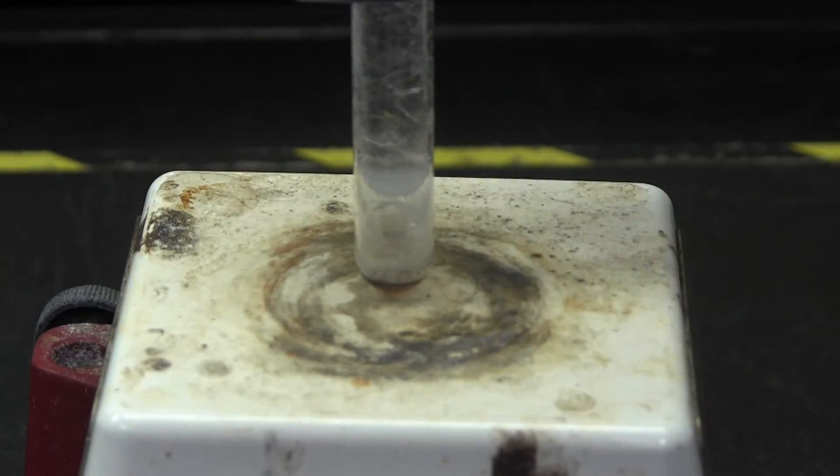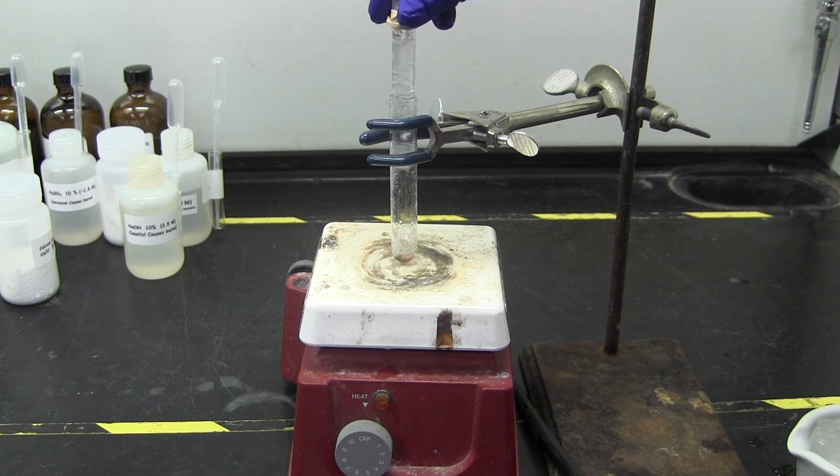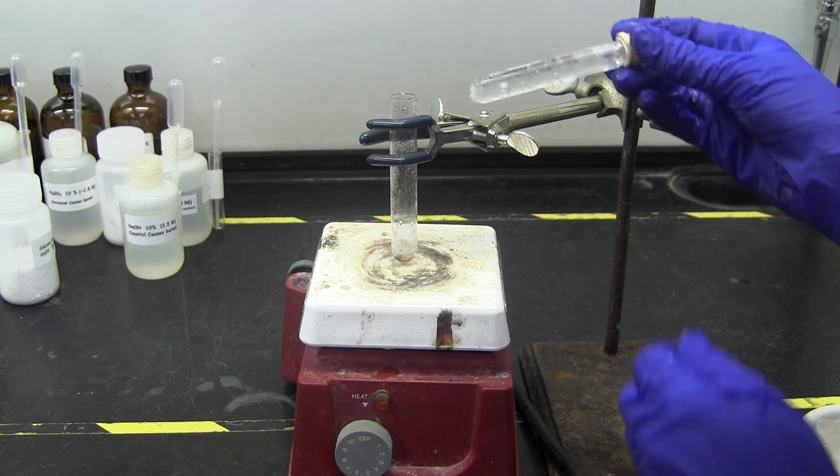Once this appears to stop thickening, the reaction is complete and should be taken off of the heat. Then, carefully remove the small test tube and scrape the film into a weighed vial.